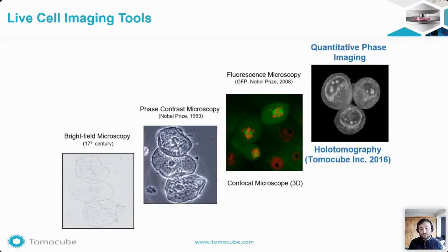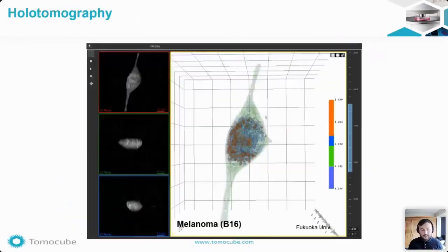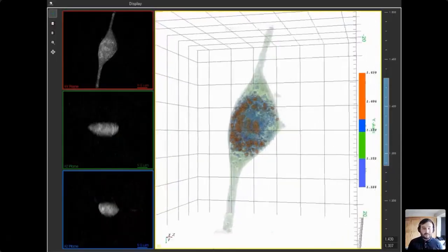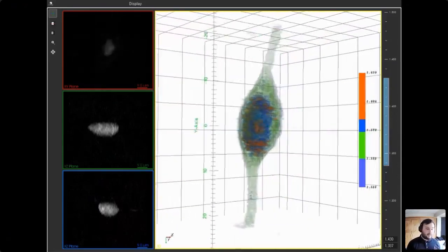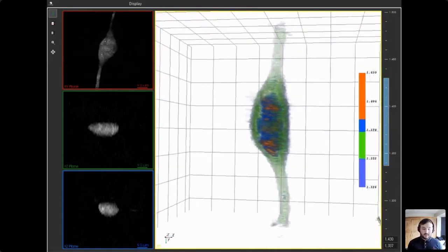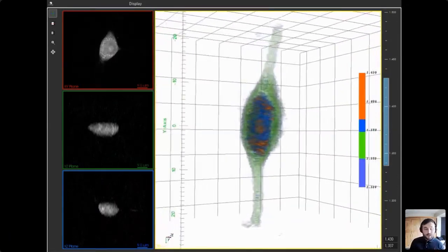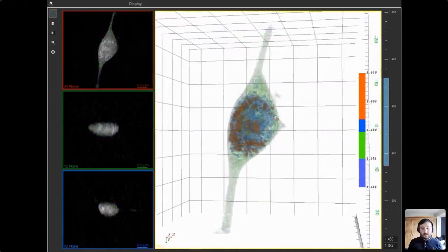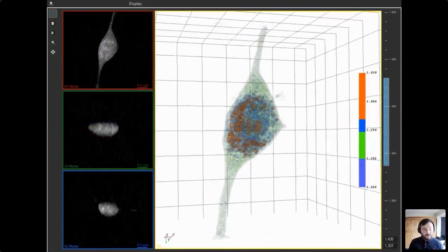TomoCube has taken QPI to 3D imaging through a technique called holotomography. Using the TomoCube microscope, a true 3D image of the cell is generated, crucially without the use of any labeling. Looking at the top left, we can slide through the Z-plane of this 3D image. In the big panel, the contrast in the image is provided by the refractive index of the cell compartments. We can then assign color to specific bands of refractive index to highlight different compartments of the cell and visualize it in 3D.